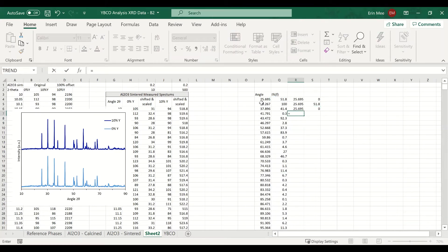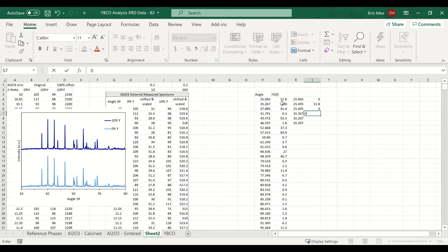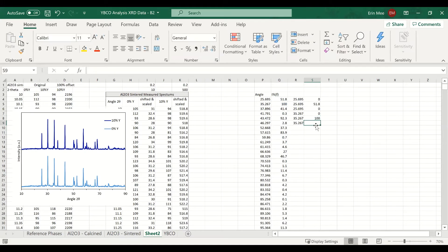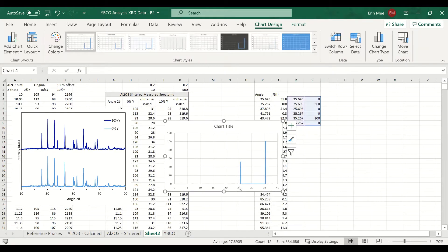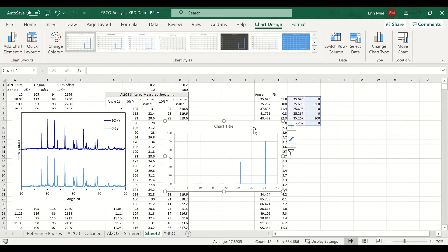So the next angle value would repeat the same way. For example: zero, then 100, then zero again. If we graph this, we'll see it starts at zero at that angle of 25, goes up to the intensity value, then back down to zero, then across at zero, and back up to the next intensity value and back down — giving us a baseline of zero with a stem plot at each intensity value.